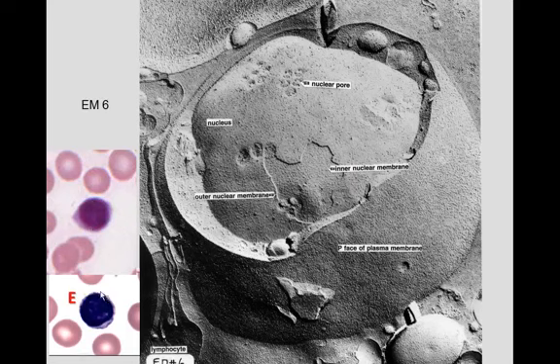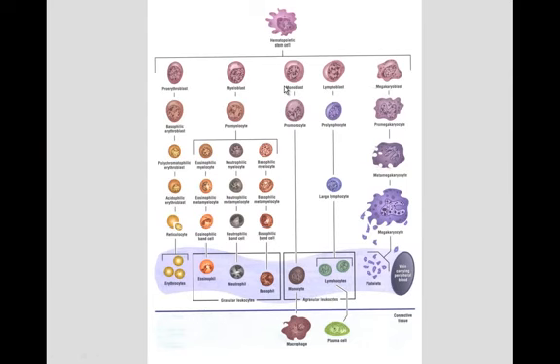And if we look at the lymphocyte in a carbon replica transmission electron microscopy, there's a light view, there's another light view. This is a lymphocyte, little rim of cytoplasm around it, big nucleus, mostly spherical. In the nucleus, we can see the nuclear envelope, the outer membrane, the inner membrane, and we can see nuclear pores. We can see nuclear pores, one of the things that we're supposed to see today.